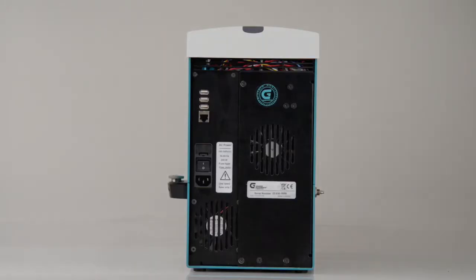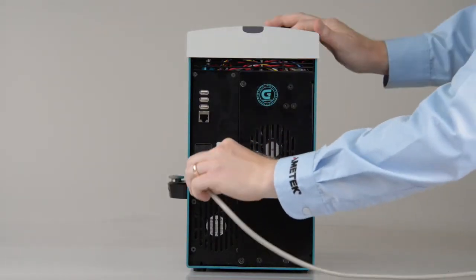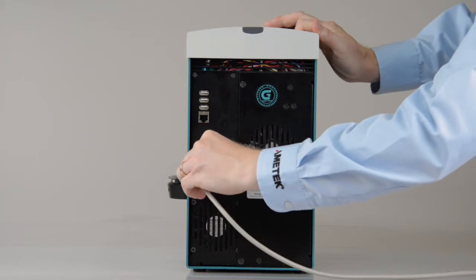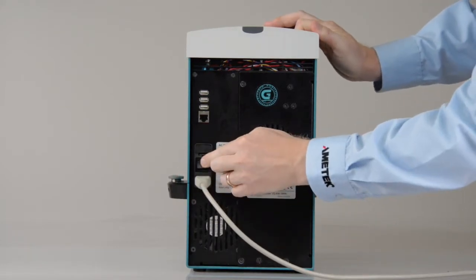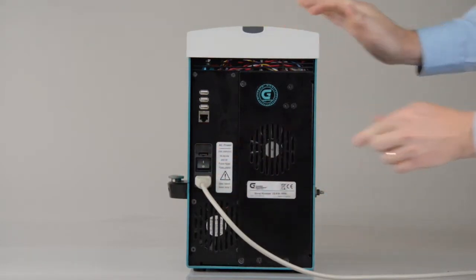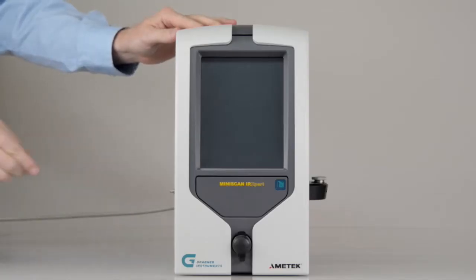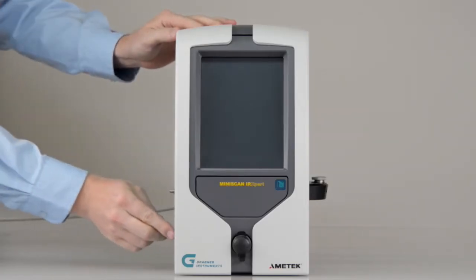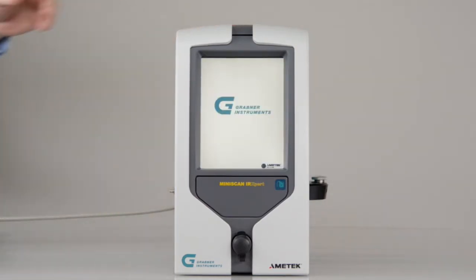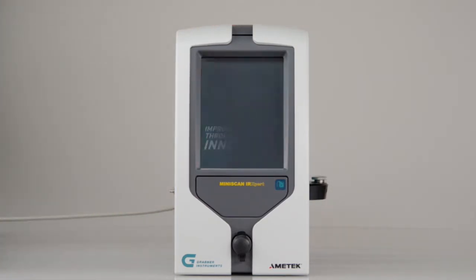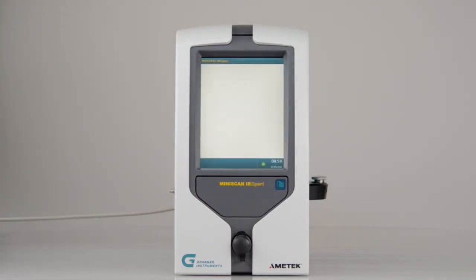Connect the power cable to the rear side of the instrument. Turn on the analyzer. There is the main switch at the back and a standby switch at the left side of the unit. For turning on the instrument, use the standby switch.